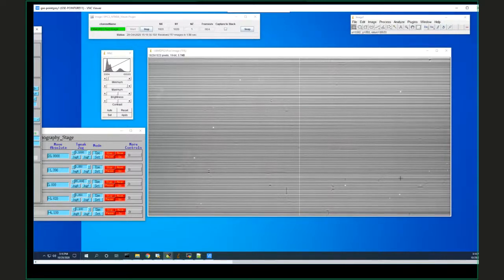The stripes, I told you, come from the fact that along the length of the mirror, it's not completely flat or completely smoothly varying along a curve, but there are high frequency ups and downs, and those cause focusing and defocusing effects of the X-rays, leading to these bright stripes. But as you look at this image, it's updating at many tens of frames a second. It's collecting at 130 frames a second. ImageJ here is updating at 50 or 60 frames a second, but you don't see these things moving. It seems to be pretty rock solid.